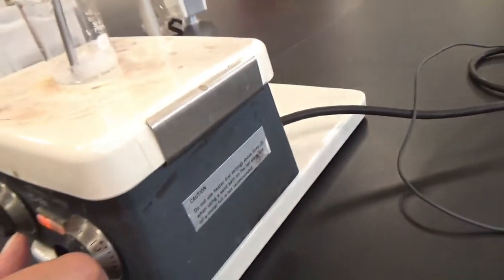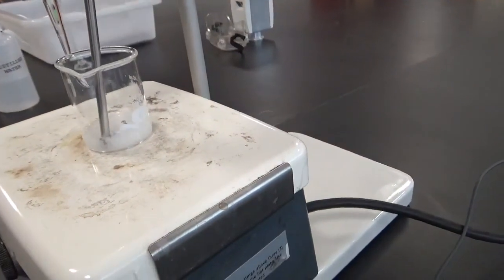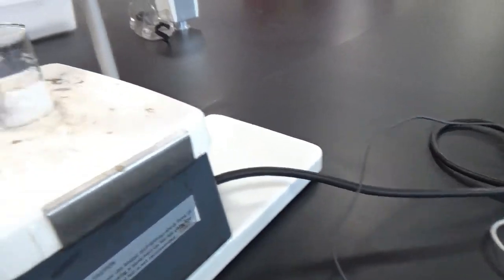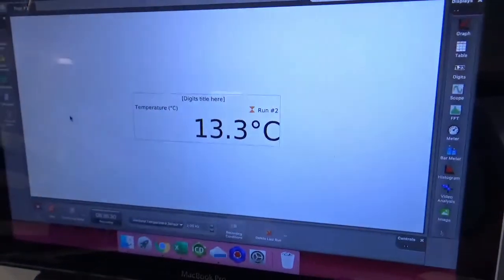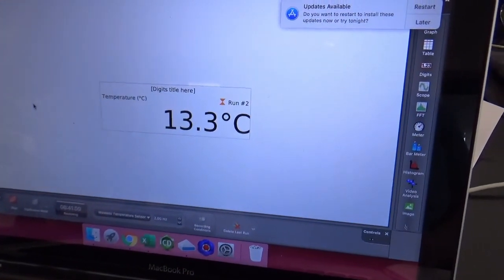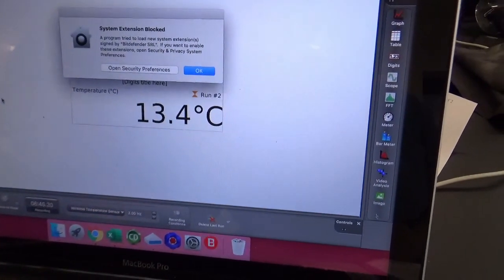So I'm going to have to heat this a little, but not for too long. So I'm going to put the heat on 2 and just count to like 3. I'm going to turn it off. Look, it's going up. So I'm just going to be very careful about that. What is that thing? Don't know.